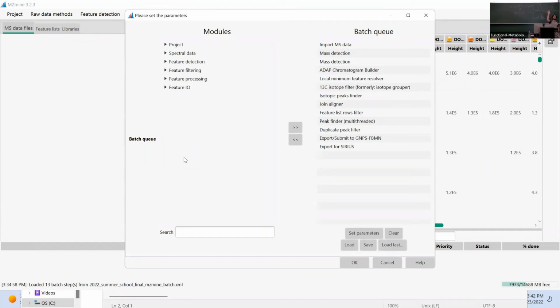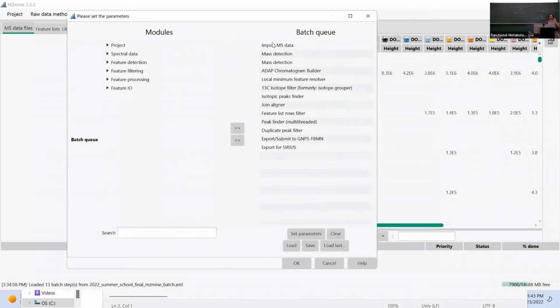Can I say one thing? All right. Because many people have the same problems, I'm just going to try to summarize the conversation so that everyone maybe knows where the problems are. Usually, all this complex clicking that we did, we don't do. We usually jump directly into the batch mode. So did everyone manage to at least download the batch file from the Tuesday folder and go on load and has it looking like this now?